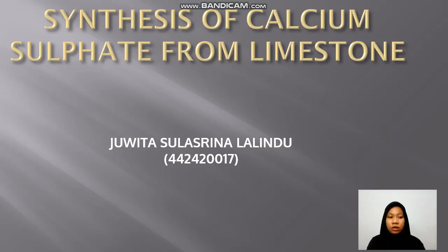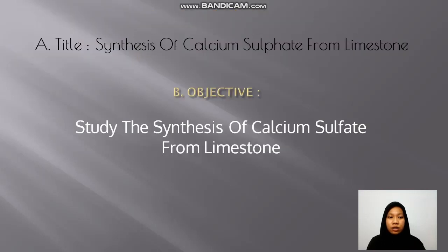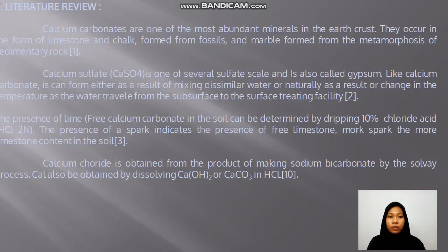My student number is 442,420,017. In this video, I will explain the synthesis of calcium sulfate from limestone. Objective: study the synthesis of calcium sulfate from limestone.